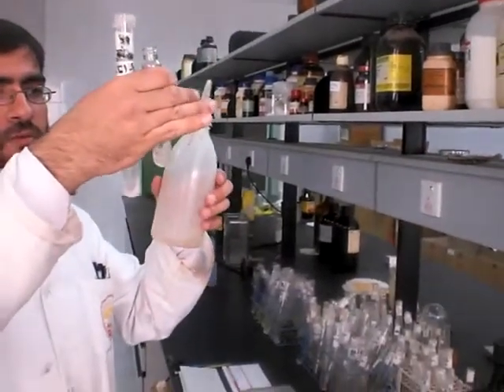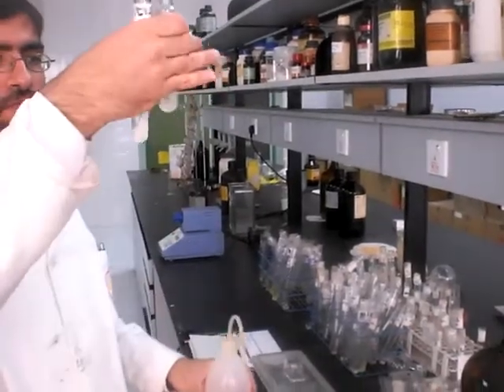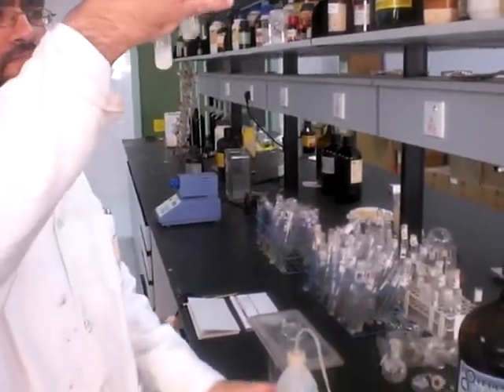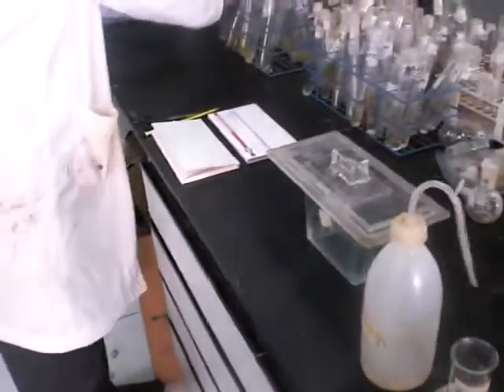Here he dilutes the solution of the reaction to be suitable for the TLC plate. We don't need very large concentrations.